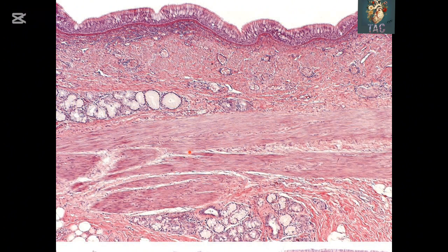This is also an important feature present posteriorly, and you can also see a large number of glands. These are mucus secreting glands, and some serous secreting glands are also present. So this slide is that of the trachea taken from the posterior aspect.